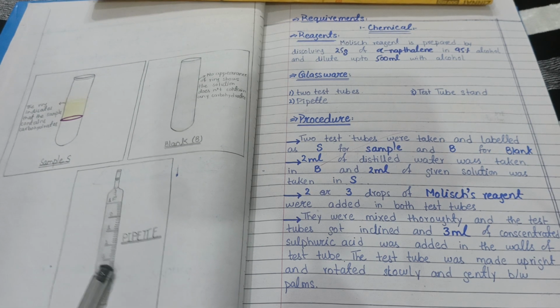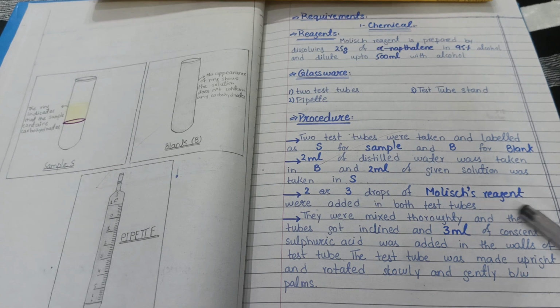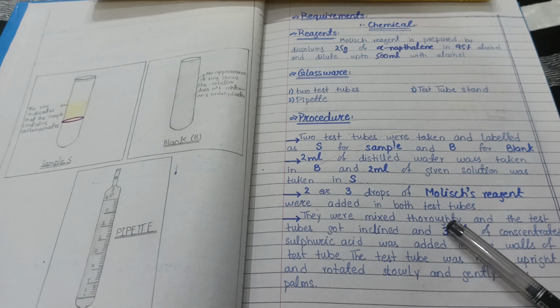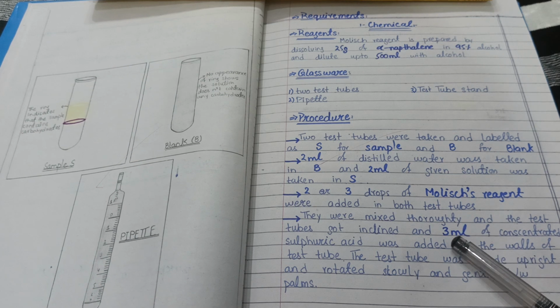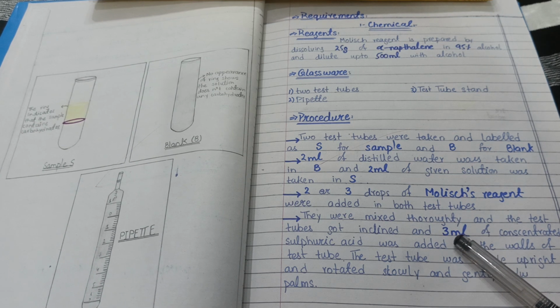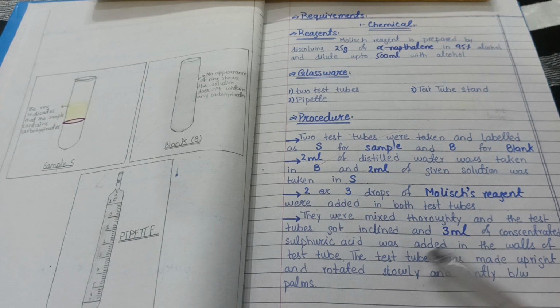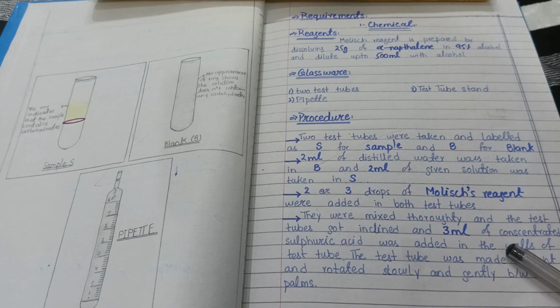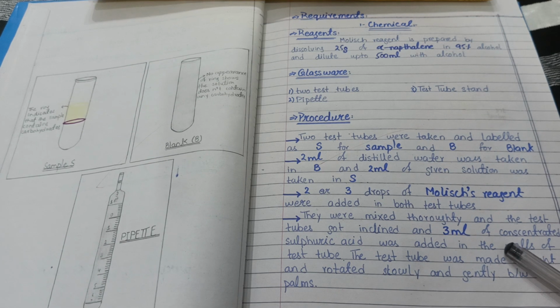This is the structure of a pipette. Now after that you are going to add 2 to 3 drops of Molisch reagent. Then you have to thoroughly mix them, and after that you have to add 3 ml of concentrated H2SO4 to it, so that the reaction takes place, and you have to gently rotate it with your hand.